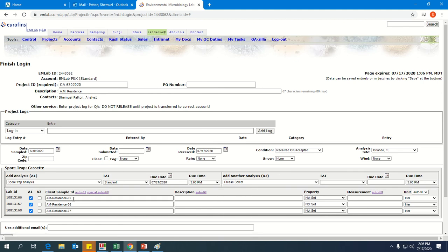And that allows you to fill in your sample IDs quicker, more efficiently. And it works better, obviously, when you have more than 3 samples, but it's a cool tool that you can utilize whenever able to, and it saves time. But for now, that is all I need.